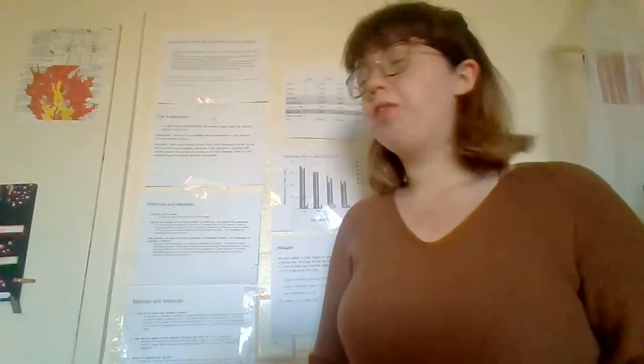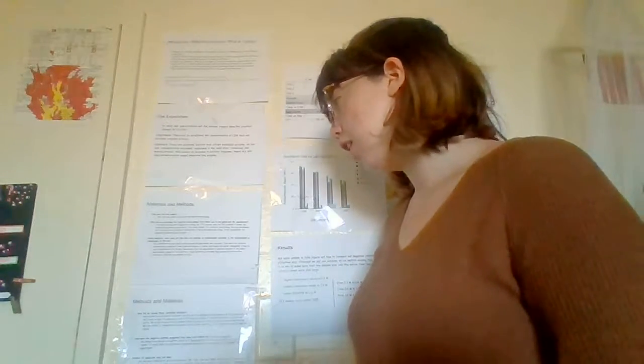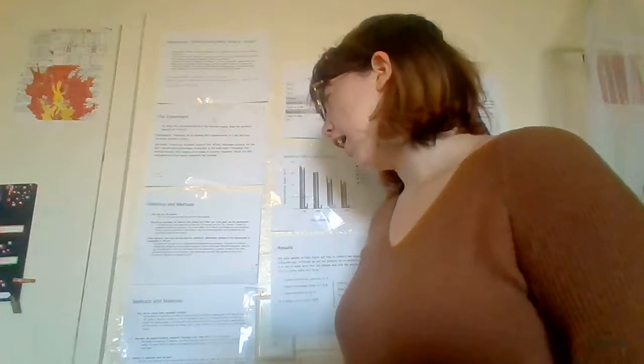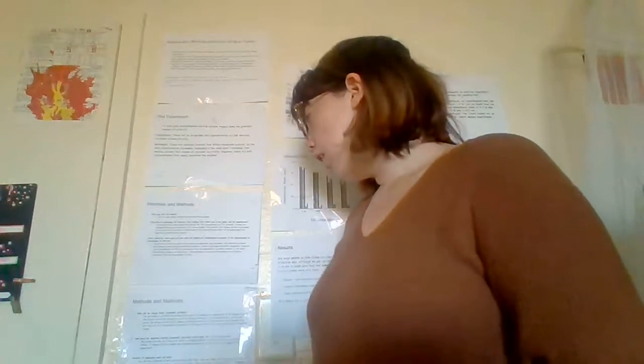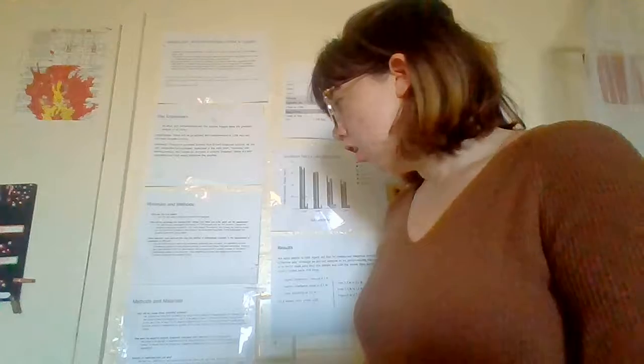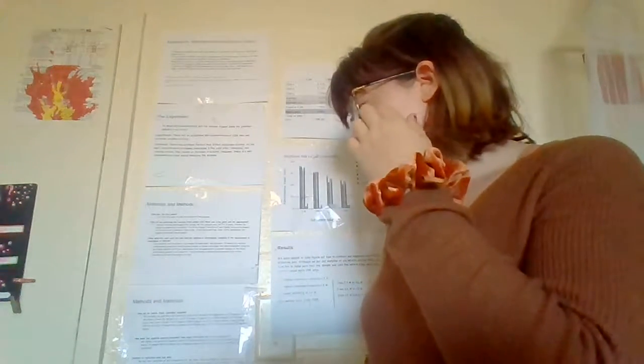And we used the spectrophotometer at 440 nanometers on the supernatant because of the added sulfanilamide groups. We determined that high absorbance indicates high enzyme activity, and the opposite, low absorbance, indicates low enzyme activity.